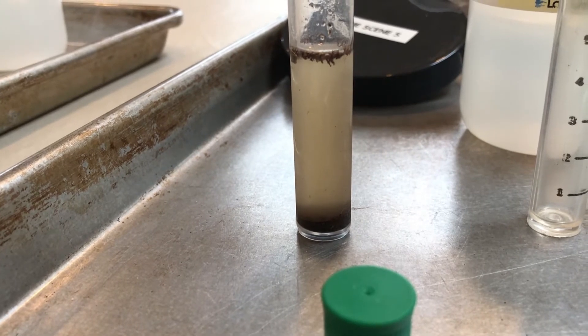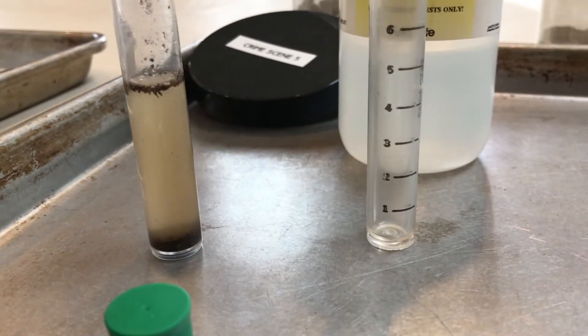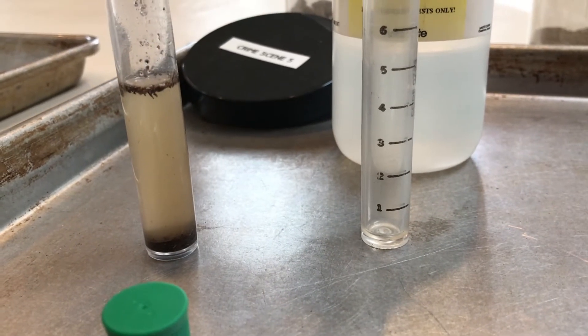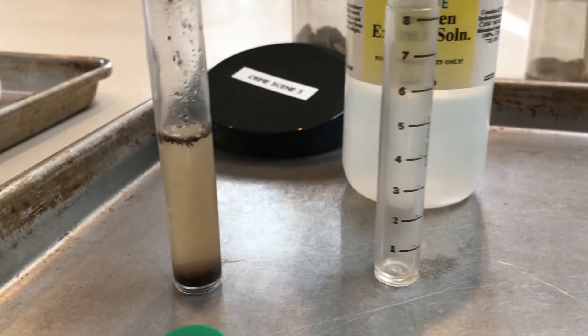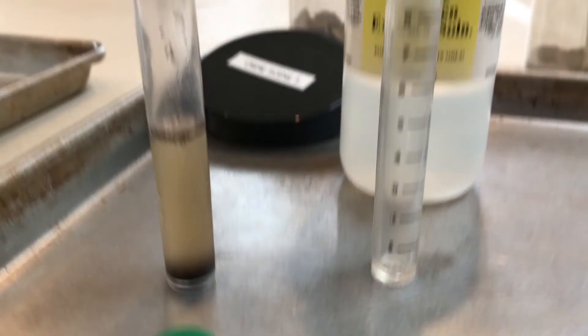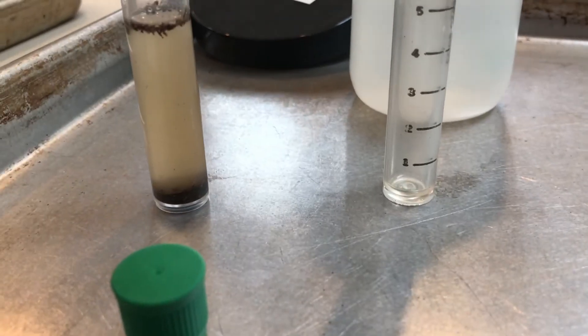Now what we need to do is take that clear liquid and pipette it into a different test tube so we can actually add our nitrogen indicator powder. So this is how you pipette. You want to make sure you take a dropper. You squeeze the dropper so there is no air in it.